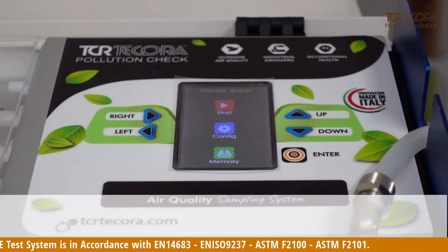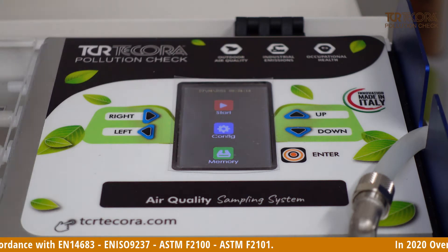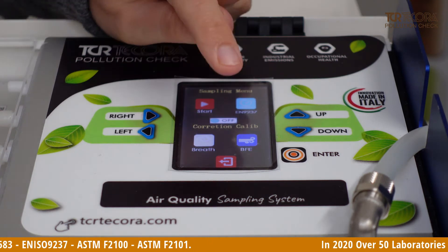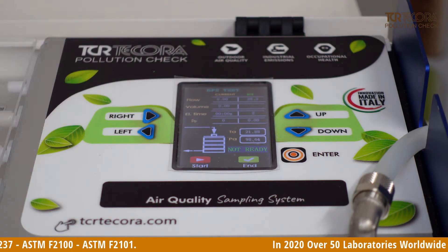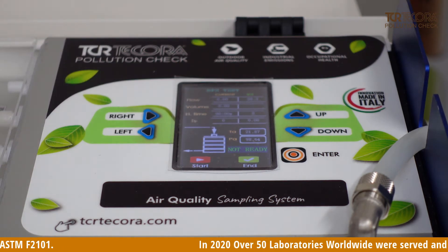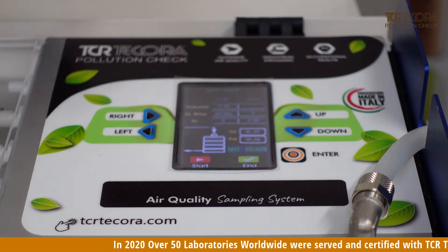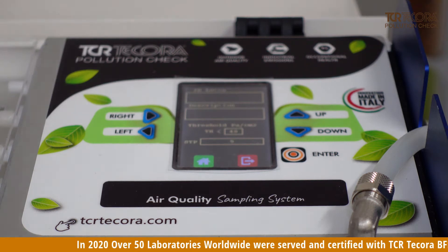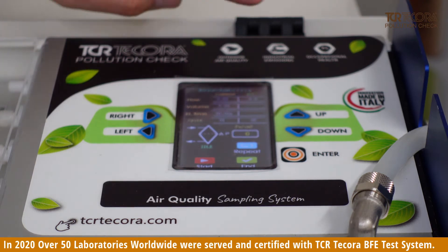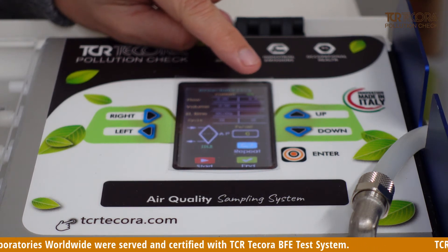The Bravo X biosampler has a specific menu which lets you perform in a very easy and controlled way your test on your surgical mask, both for the BFE — this is the specific menu page where you can set all the parameters for the BFE test working at 28.3 liters per minute — and the breathability test, where you can set all the parameters required for this test working at a set flow rate of 8.0 liters per minute.